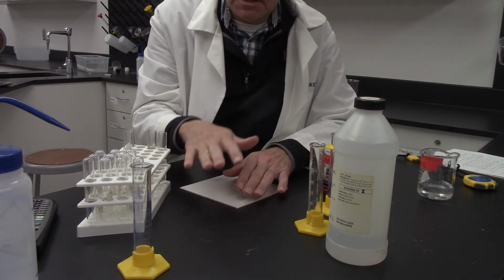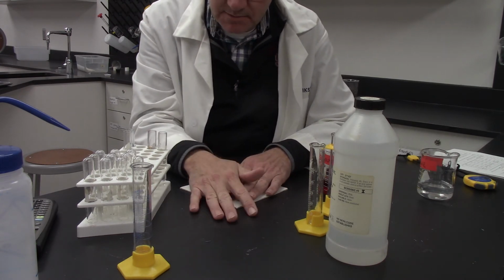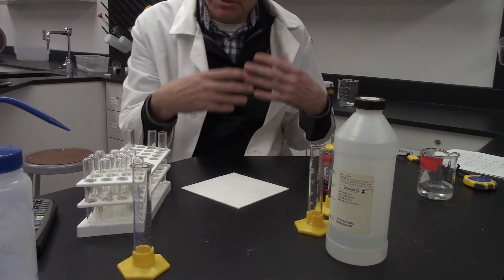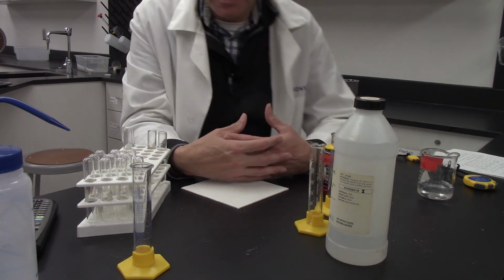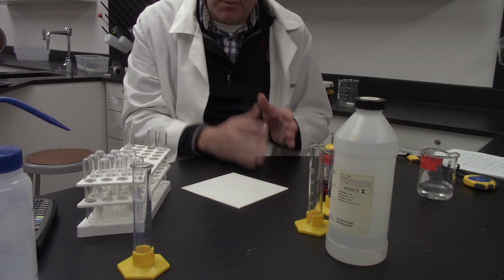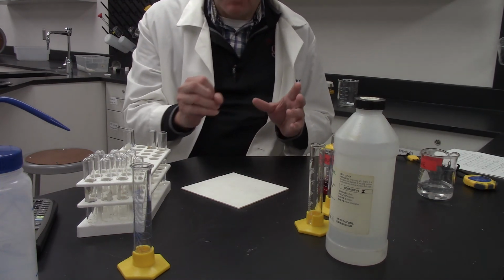What you'll see is that when you're running the reaction at a very, very cold temperature, it's going to take a lot longer because the molecules aren't moving around as much. You don't have as many collisions. It's going to take a lot longer for that iodine to react. You're probably going to get it around 10, 11 degrees Celsius, something like that, on that cold side.